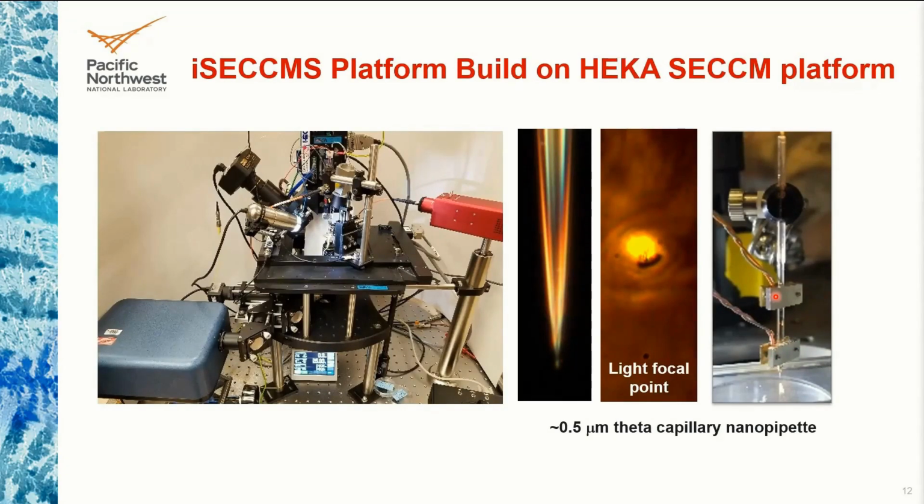It is good in some cases where you do not get a very good current response, or when you want to use a very small tip, so shear force microscopy comes in handy to achieve that.